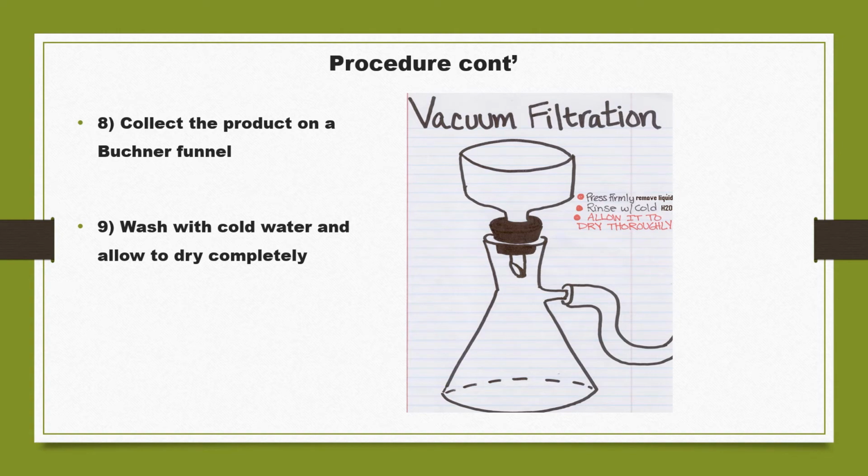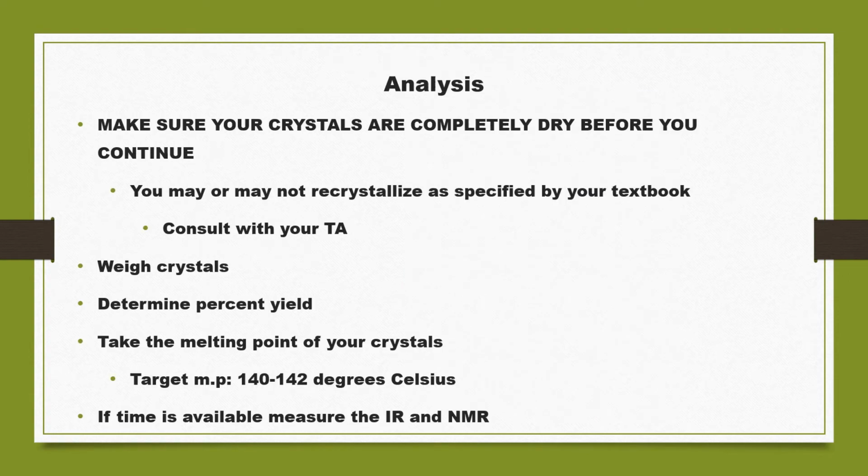And then you can use your previously cold water in a beaker to wash your samples, and you can do this while the vacuum filtration is running. You can add using a pipette, okay, plastic pipette or glass pipette, and you can make round around the samples, and in that way you can effectively wash your samples. Then finally you go for analysis, taking your sample.